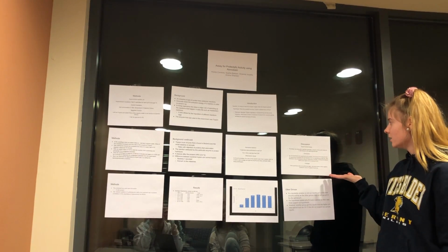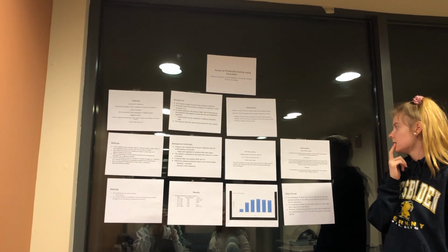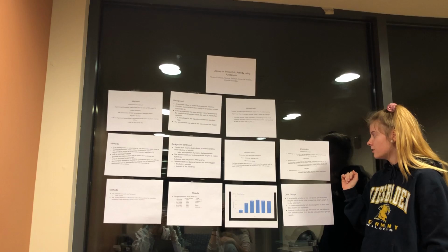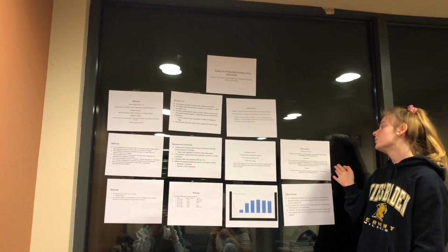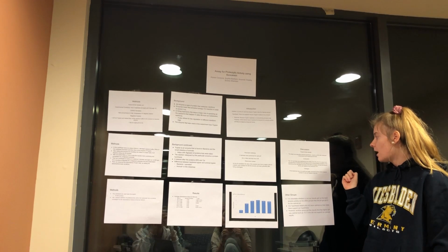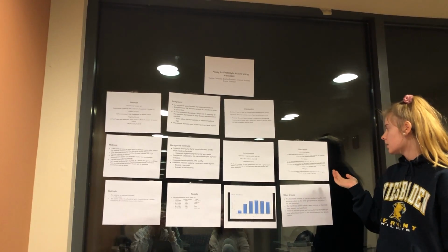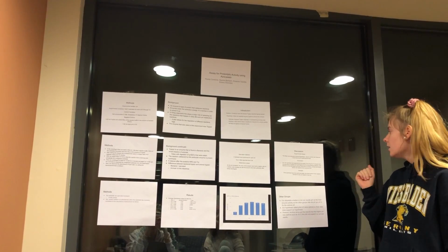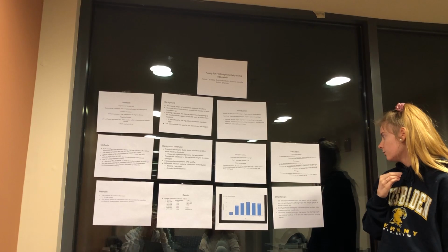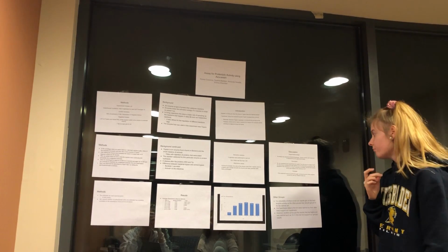So then in our discussion, regarding our experimental design, we said that our design was adequate to test the hypothesis. The enzyme activity was measured in absorbance by the spectrophotometer. Our conclusion was that the hypothesis was supported by the results. From a pH of 5 to a pH of 8, the absorbance increased and was highest at 8. The absorbance then decreased at higher pH, proving enzyme activity was highest at the basic pH of 8.